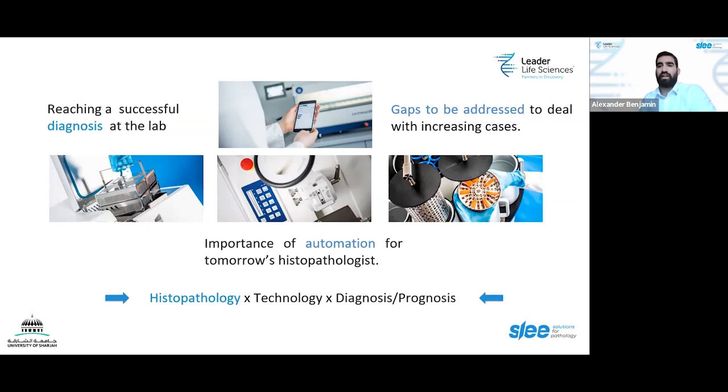So unfortunately, until today, it's not possible, or fortunately, maybe, this is a big long discussion. Technology cannot do everything. There are sensitive processes throughout the process itself, like the orientation during embedding, or the orientation during sectioning, because this is a very important part. We usually talk about sections, how easy they are made, or how fast we can make them, but sometimes we forget the most important part, which is accuracy. If we don't have accuracy throughout the process, then the fast result has no meaning.